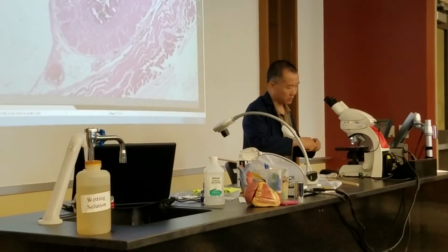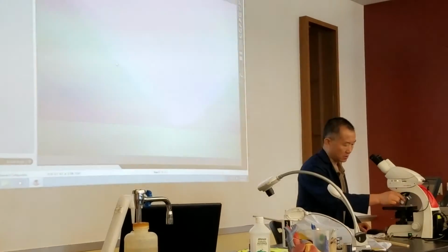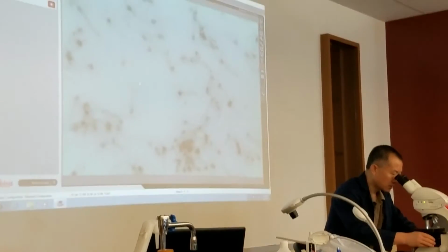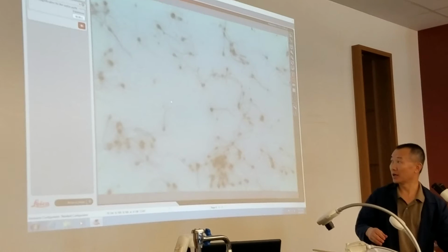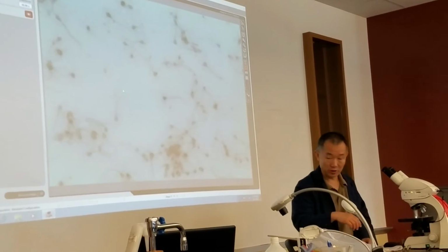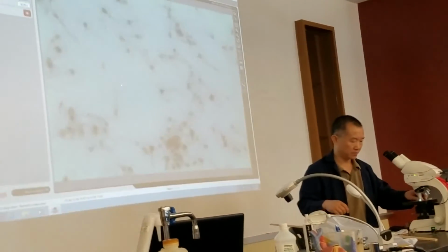This slide is very easy. I actually give you 2 points for that. You just see the cells like that, and you just say, okay, this cell is spermatozoa. That's it. So that's the easiest 2 points. Yeah, prostate glands.